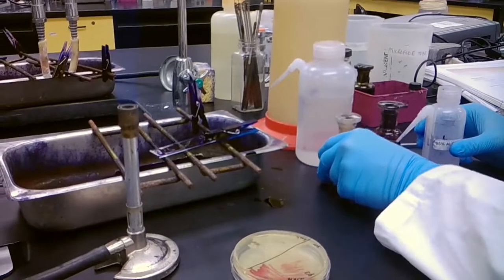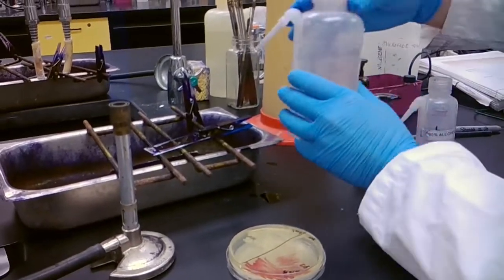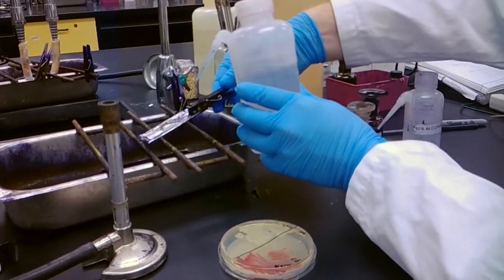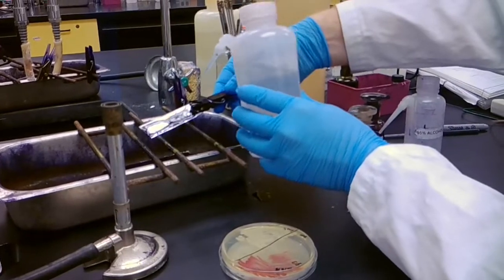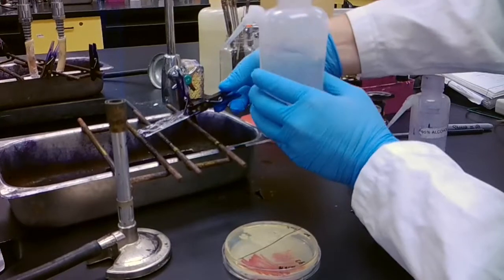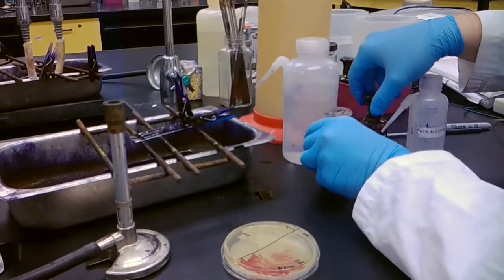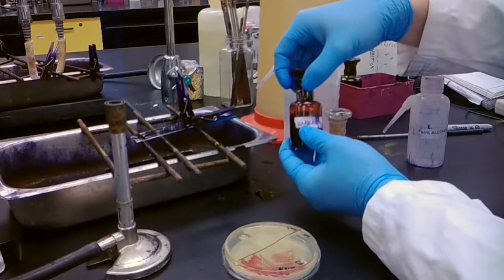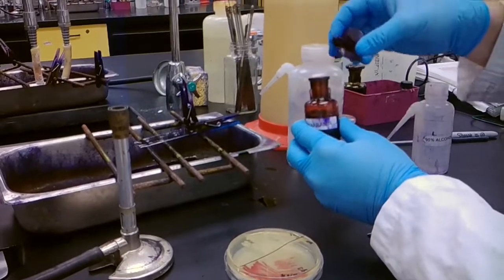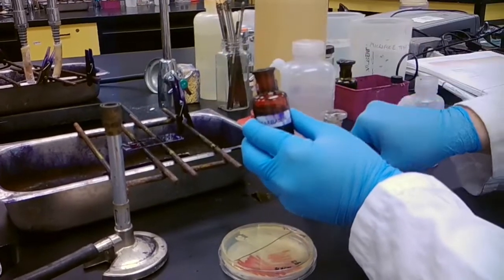Afterwards, we're going to rinse off with water to remove any of the ethanol that's remaining. Now that we've rinsed off the ethanol, we'll apply safranin, which is our counter stain. And then we'll let this sit for about 30 to 60 seconds.